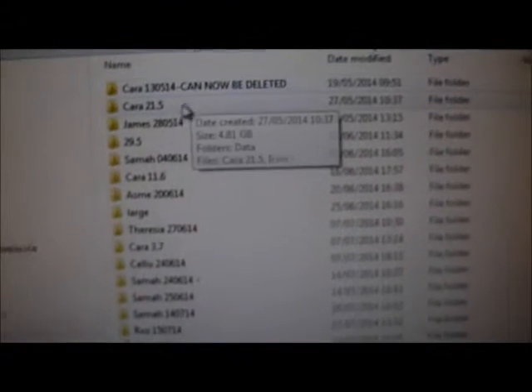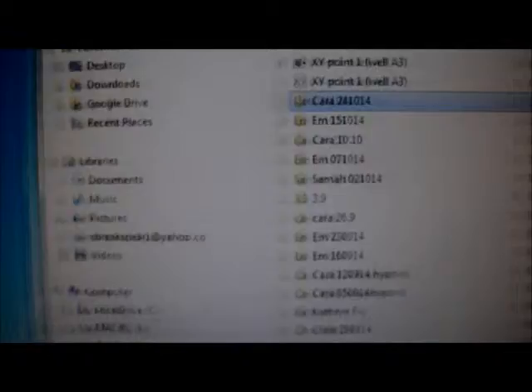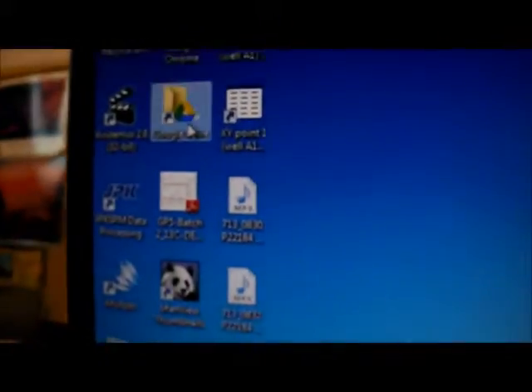Okay, let's just go to File Manager. So this is the MacPack drive, and then you look for live cell images for transfer, and then if you just arrange it in date order, by date modified, you will see the last run which we transferred. Okay, that's the first run. Click again, 24/10/14, that's the last run. Okay, so just leave that there for a minute and then find some sort of destination drive.